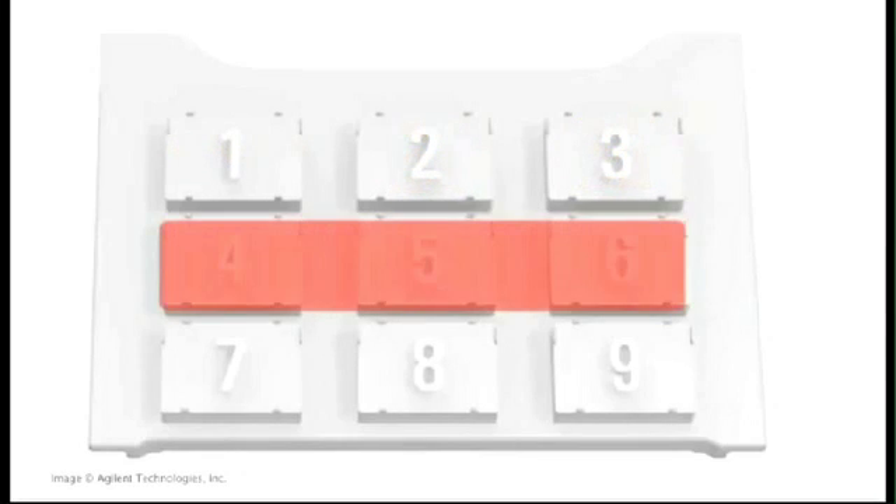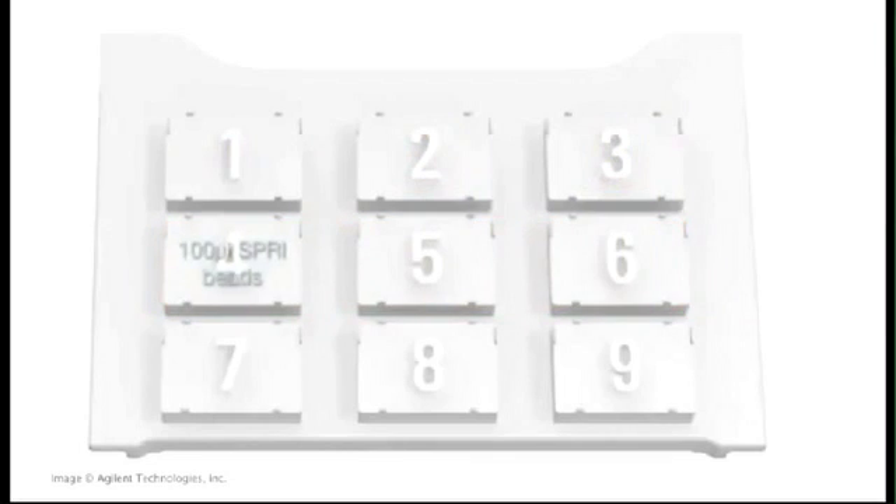Across the middle of the deck you will see all of the reagents in 96-well plates. On the left side, position 4, are the SPRI beads — approximately 100 µL of SPRI beads in each well. In the middle, position 5, is the 70% ethanol used to wash the beads. On the right side, position 6, is the elution buffer.